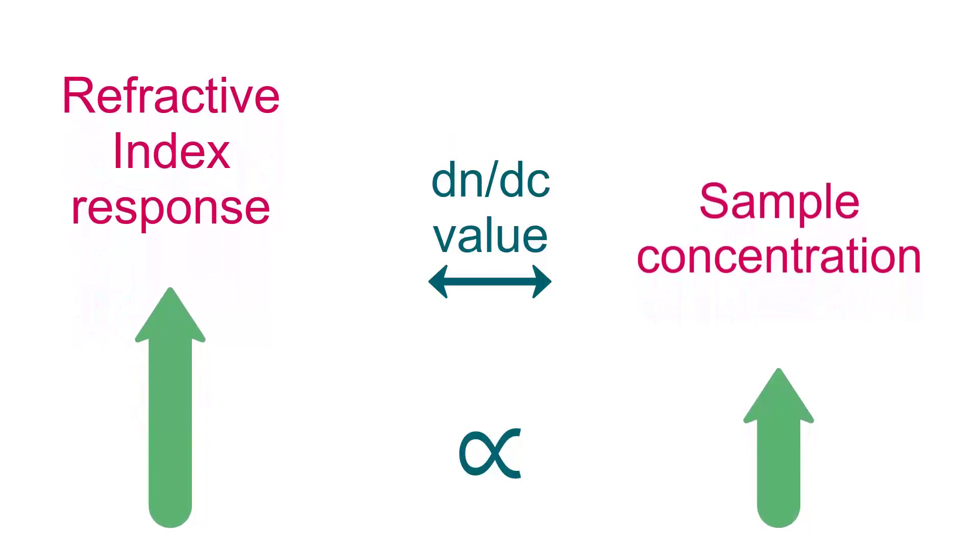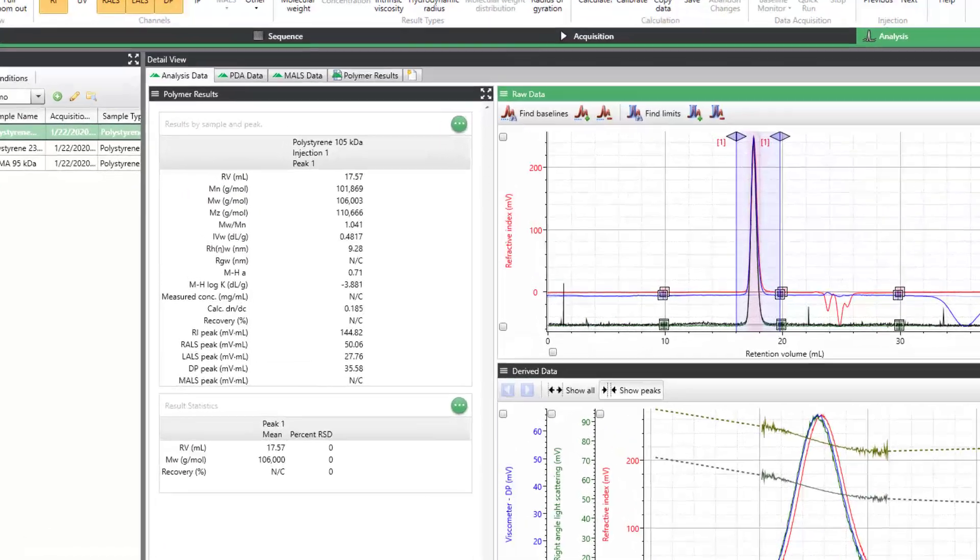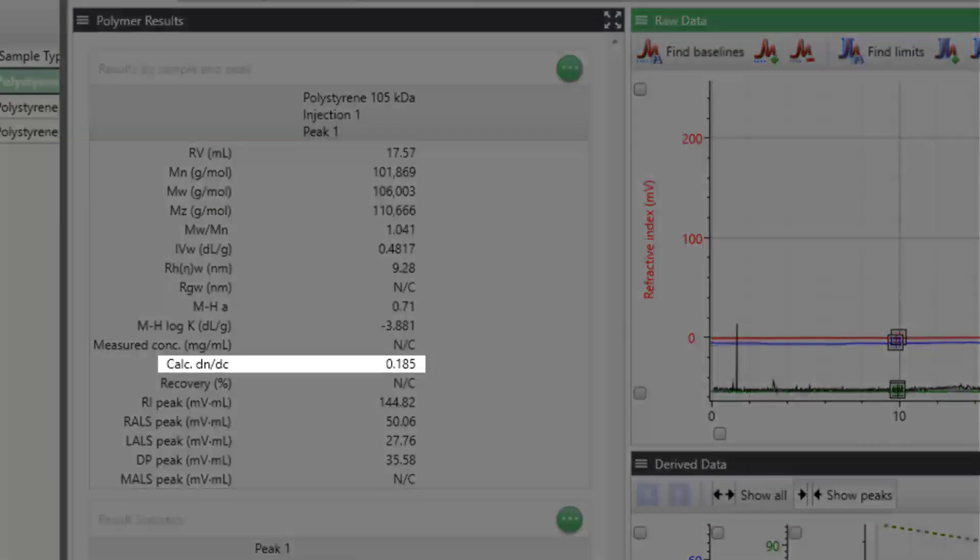As you can probably tell, knowing the DNDC value for your sample is critical to obtaining accurate results. Fortunately, the Omnisec software offers a method of determining DNDC values.